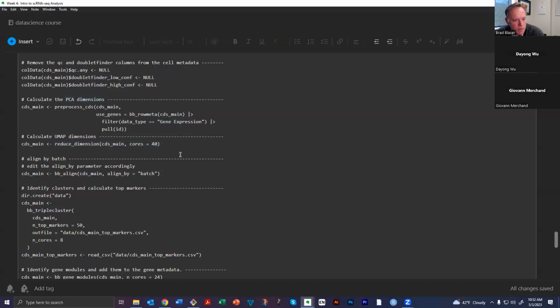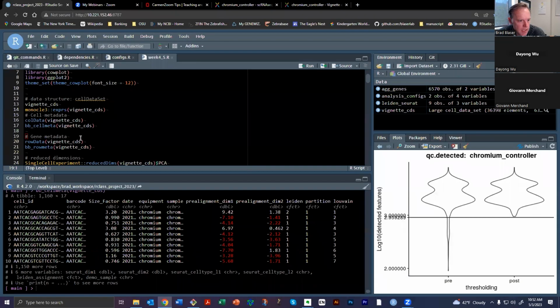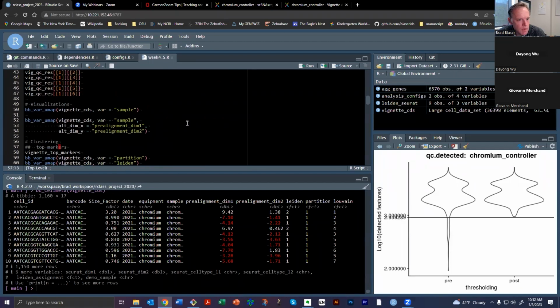All right. So let me show you what that is actually going to look like. So I go back down here. And so this is the CDS that I'm using for the example. It's named differently from what I just showed you in the script, but that shouldn't be too confusing.